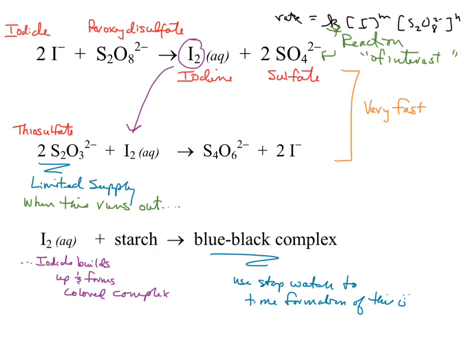So like I said, once you have these ready to go, do it very carefully, because you don't want to do it twice. Okay, if it doesn't turn blue-black, something went wrong. Once you have your set, your A and your B ready to go, go ahead and dump them. And I think it might say, let's see, it doesn't say stir or anything. I think the first one takes about 40 seconds, so it's coming. Notice that, if you look at the first 4 set, look at your peroxydisulfate. That's what's varying. Your I minus is constant. Notice that we're getting less and less peroxydisulfate. What should happen to the reaction rate? Should it go faster or slower?